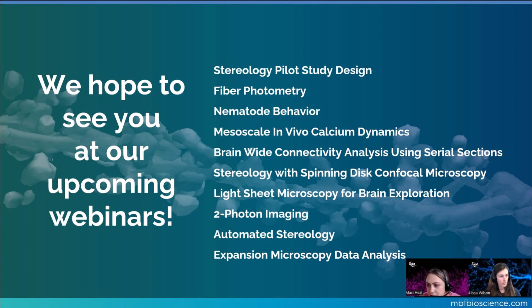There's a question for how it performs for segmenting noisy CT and microscopy data, since the examples we showed were clean for our demonstration purposes, but all the algorithms can be tailored to your data.